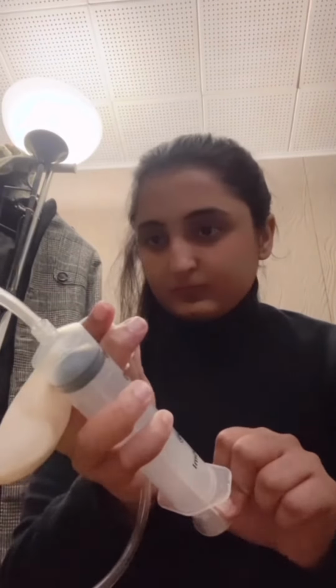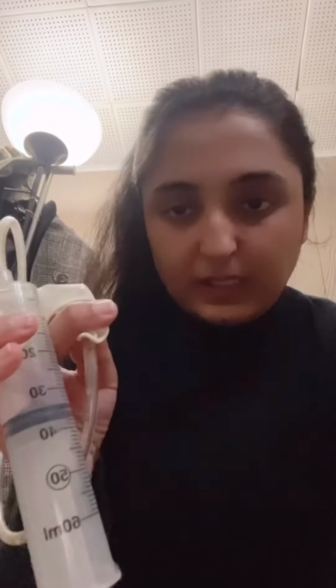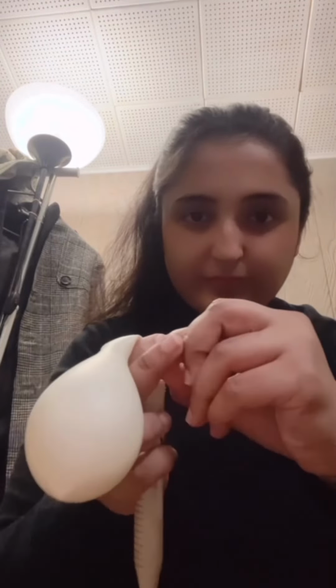So let's start with measuring carbon dioxide for lactose solution. It turned out to be 6 ml only. Now we are doing it for sucrose and yeast solution. It came out to be almost 33 ml. And now let's do it for glucose solution. The balloon with glucose showed almost 85 ml of carbon dioxide production.